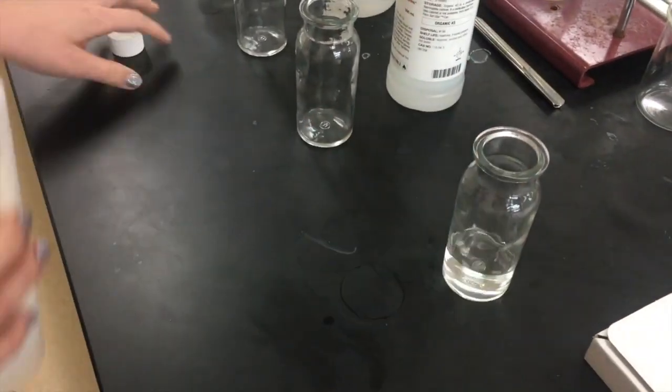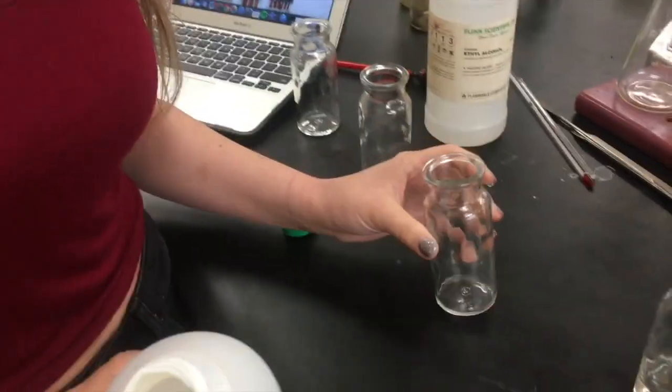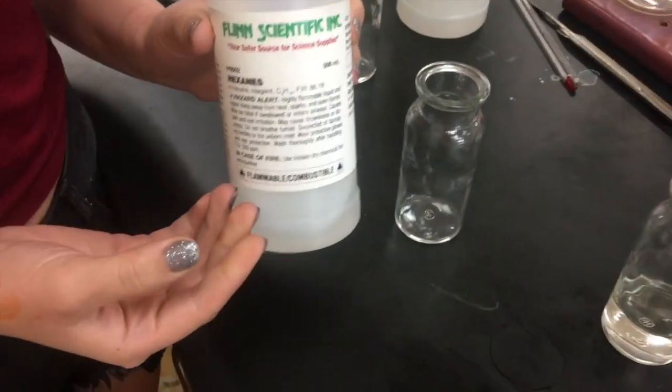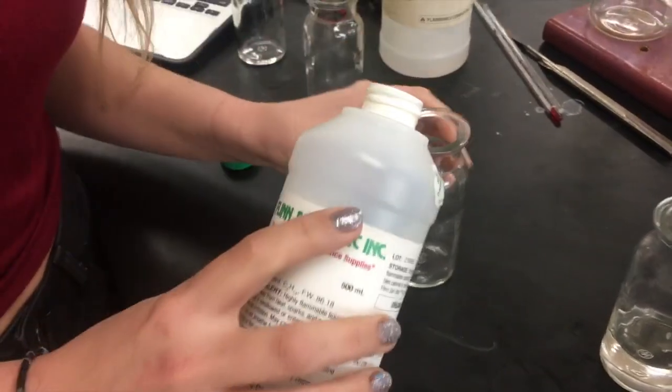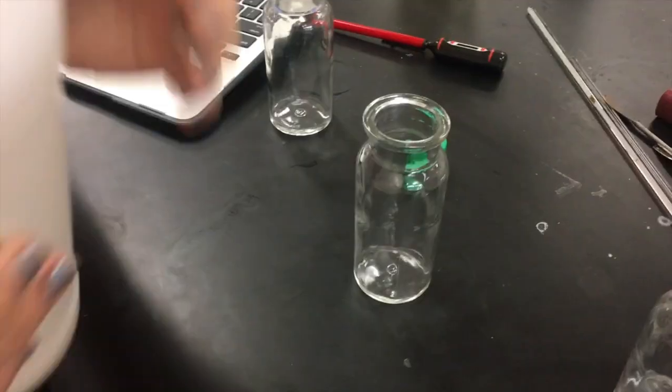Our first one is acetone, of course, and our second one is hexanes, and we're just pouring these into little collection jars. You can get these collection jars on Amazon for about $15. They're really simple, really basic, but they did the job.